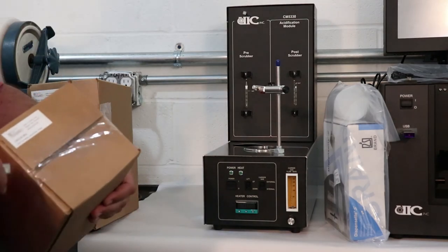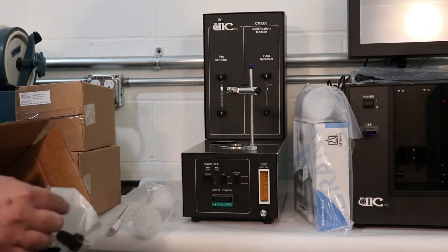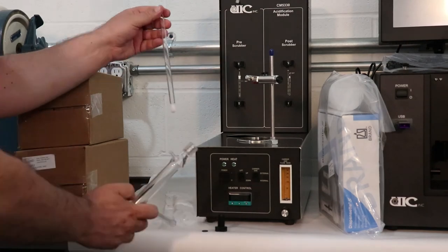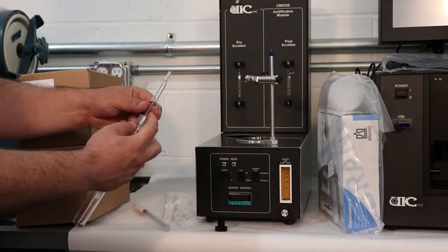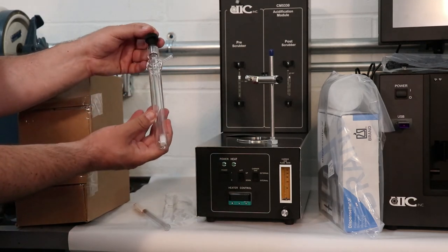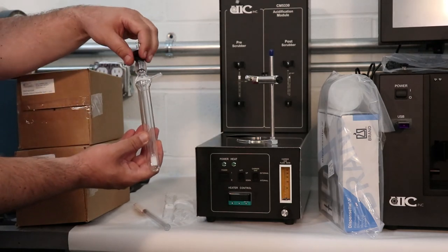Pre-scrubber. Carefully unpack all the glassware. We will start with the pre-scrubber. Unpack the pre-scrubber body, dispersion tube, and the black threaded bushing with the o-ring. Place the o-ring supplied with the black threaded bushing over the open end of the dispersion tube and insert this tube into the pre-scrubber body. Adjust the o-ring on the dispersion tube so that the tube is just above the bottom of the pre-scrubber body, and tighten the threaded bushing over the dispersion tube to seal the entire assembly.